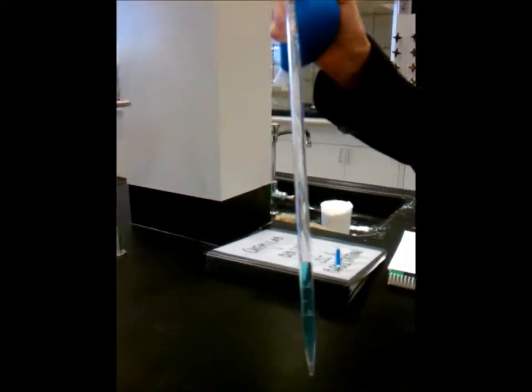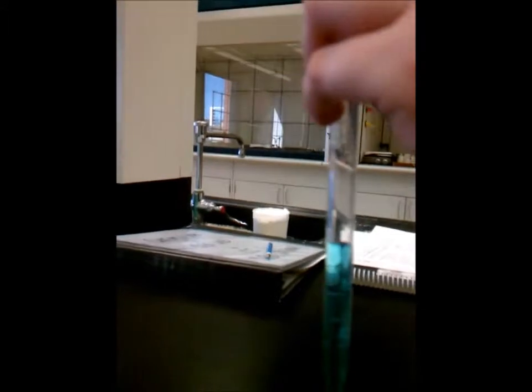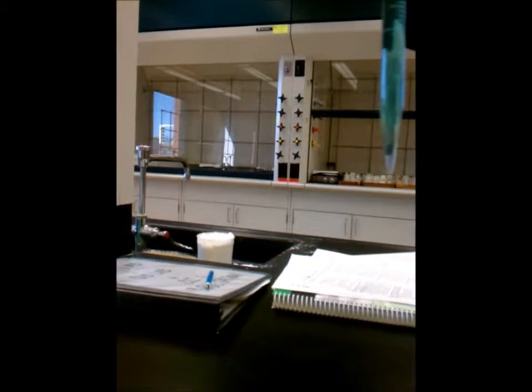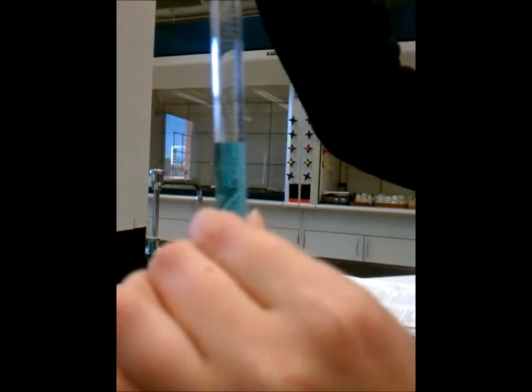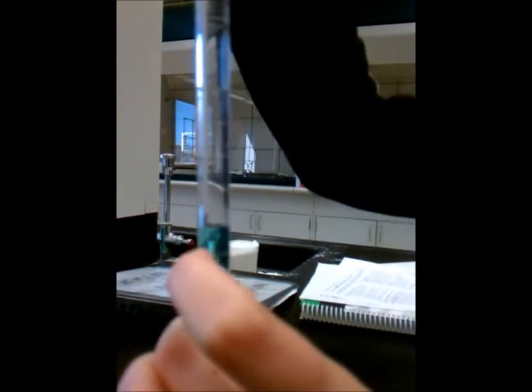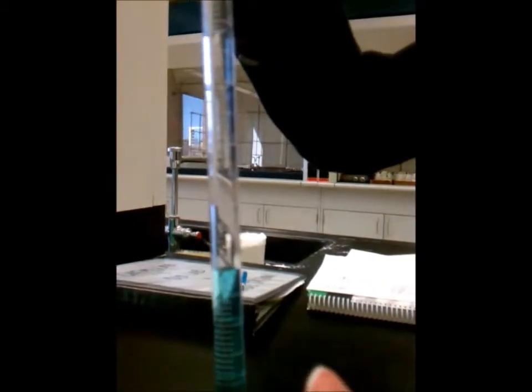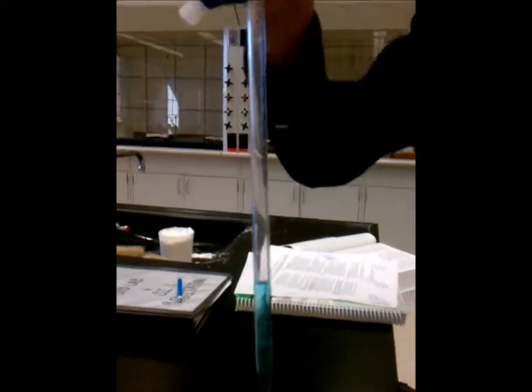Okay. I'm going to place it slightly over here. First, I'm going to read the volume, which is 8.1. I bring myself down to the... It's going to be 8.10. If I can see, the meniscus is right on the line. We always want to measure by the meniscus. Because what happens is water molecules sort of attract to the glass, and that's what raises it up and gives us that concave shape. Okay?